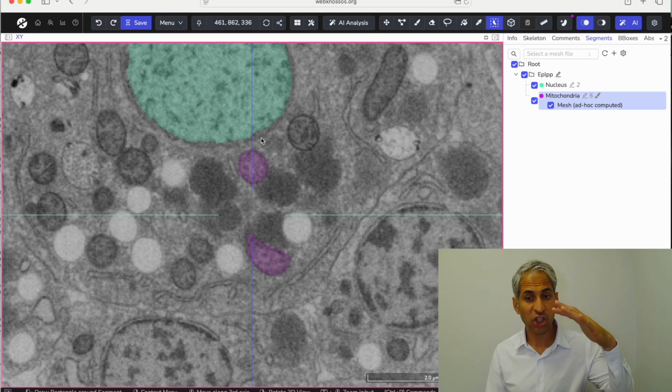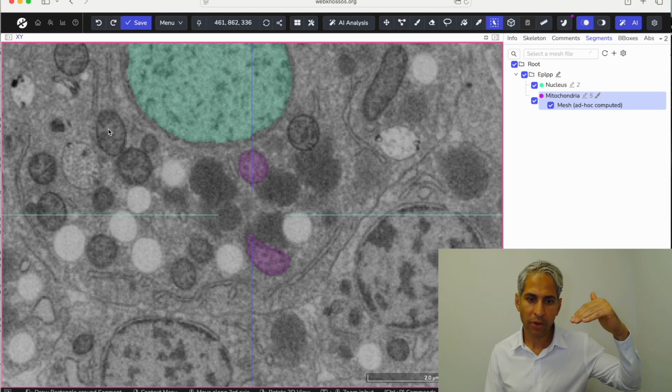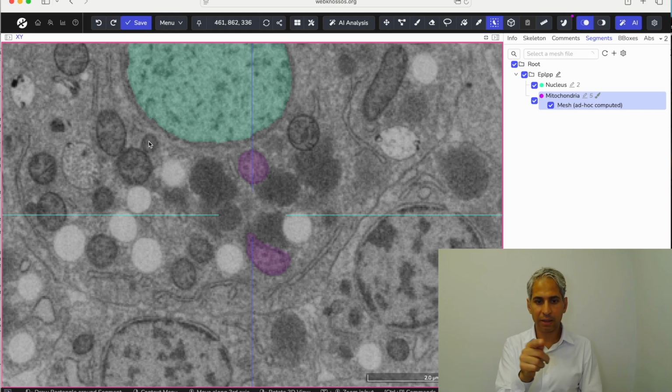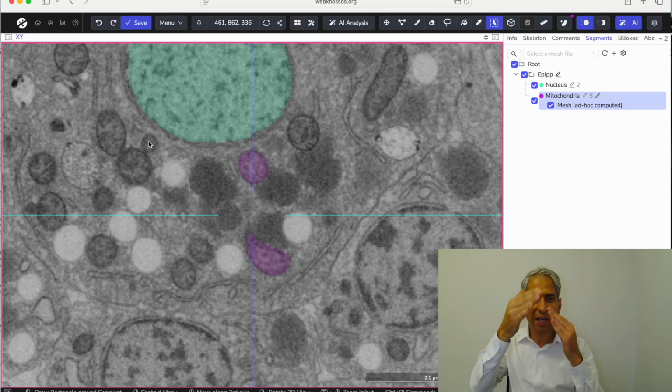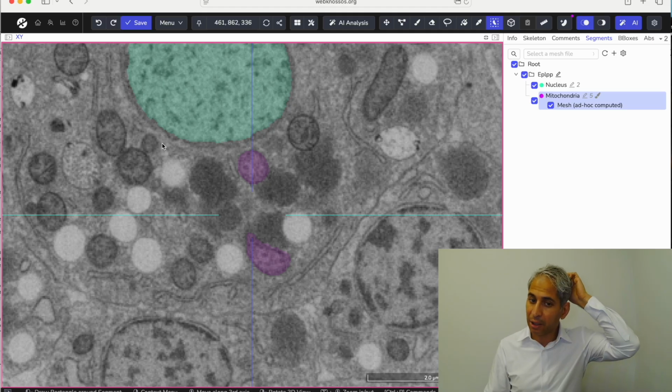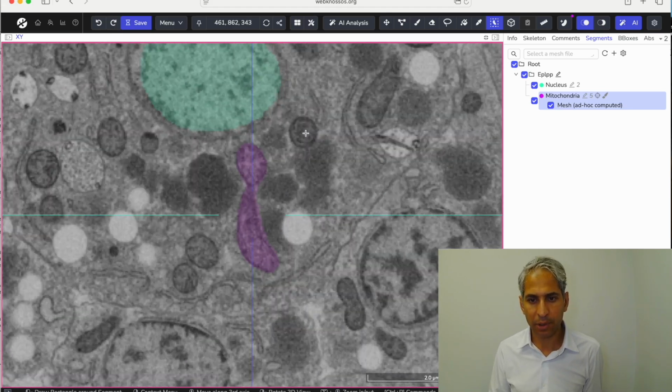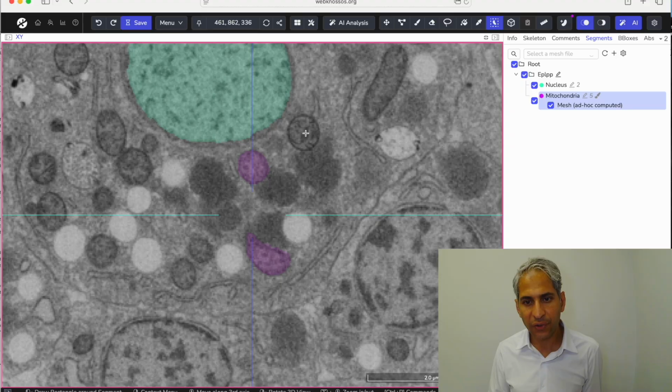The interior is a shade of gray, but there are multiple shades of gray, and the darker shades represent the lamella. But the lamella are not clearly zigzaggy as we see in diagrams. They can be at all kinds of angles that make it look a little uncommon to us. But this is also an example of a mitochondria, and it's spherical.